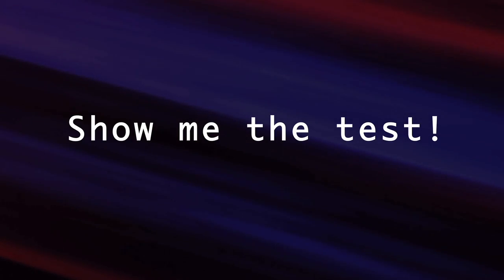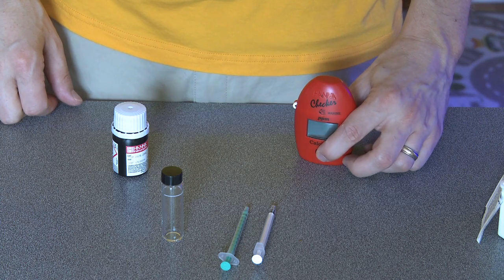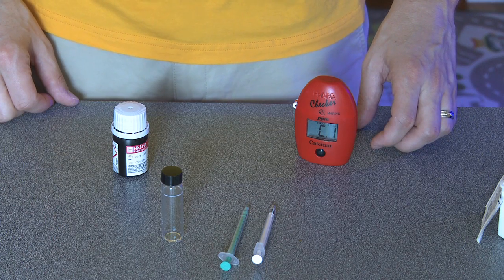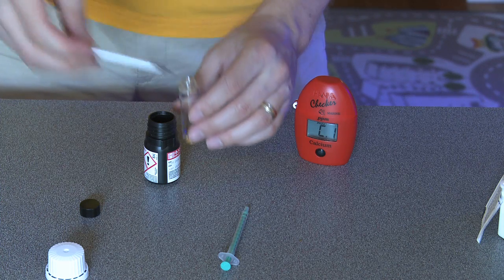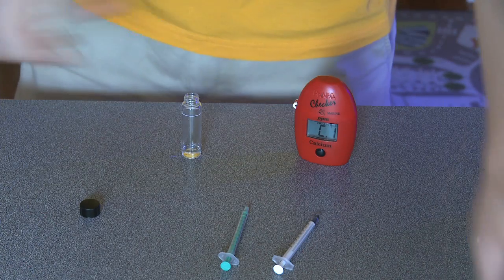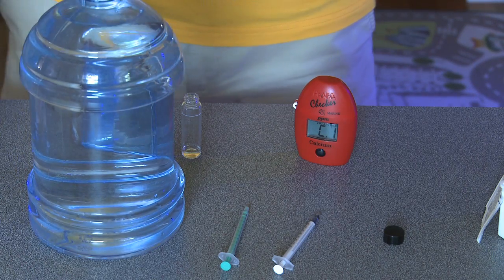Here are the steps for checking calcium with the HANA Calcium Checker. Turn on the checker by pressing the big black button. Once you see C1 on the screen, the checker is ready to go. Next, add 1 ml of Reagent A using the enclosed white syringe. Next, add 9 ml of deionized water to the vial with the supplied dropper.